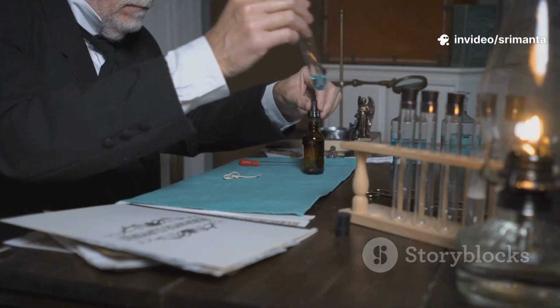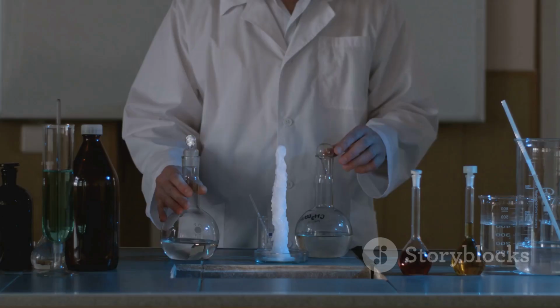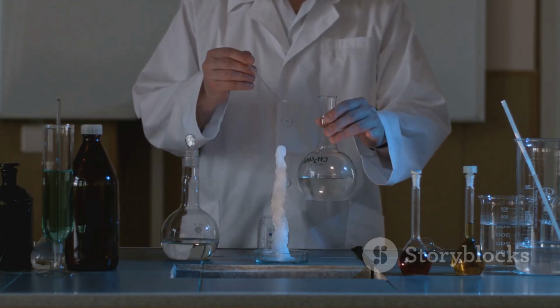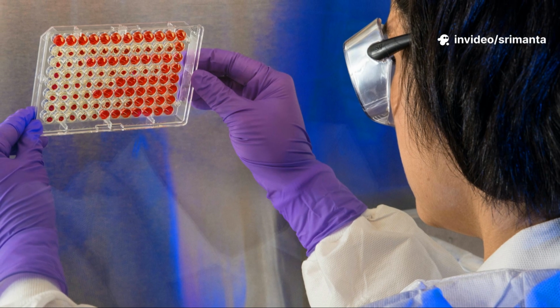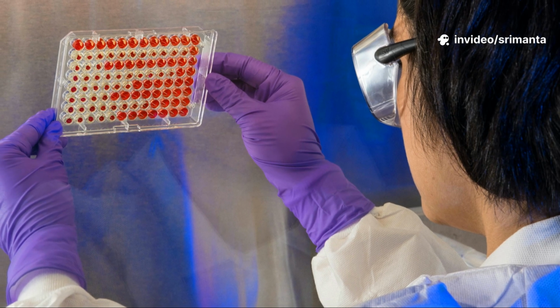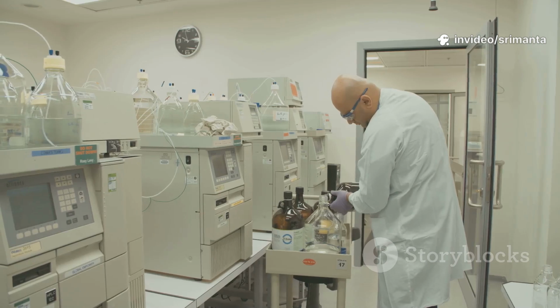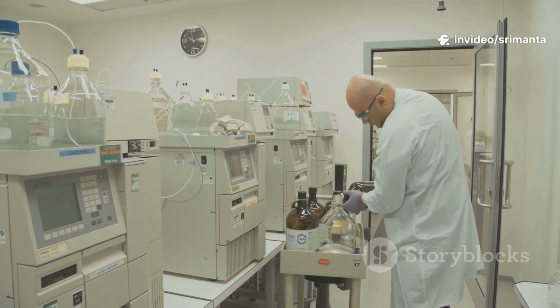It was developed by a scientist named Gutzeit, which is why we call it the Gutzeit method. The whole idea is to convert any arsenic present in a sample into a gas. Yes, a gas. This gas is called arsine gas. We then let this gas react with a special piece of paper. This reaction creates a colored stain. The intensity of that stain tells us about the amount of arsenic. A darker stain means more arsenic, while a lighter stain means less. It is a brilliant and classic piece of analytical chemistry that helps protect public health every single day.